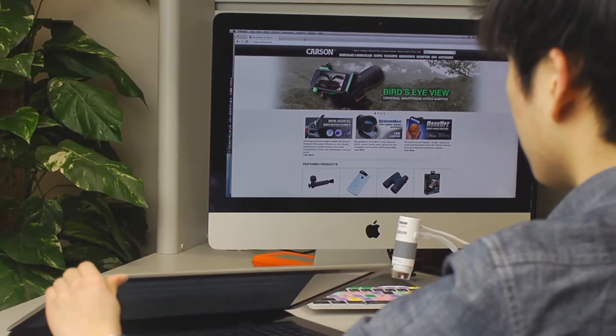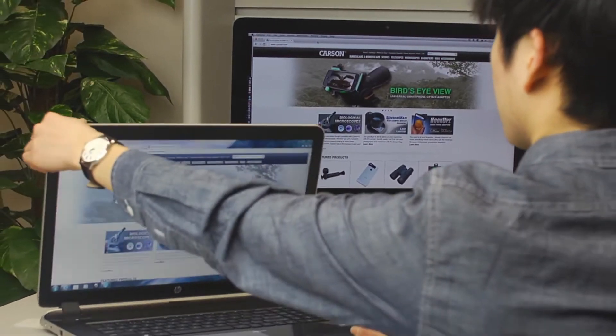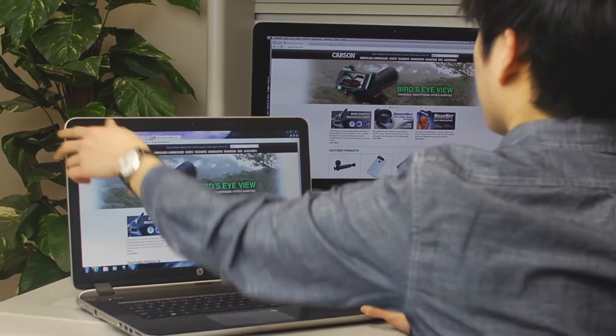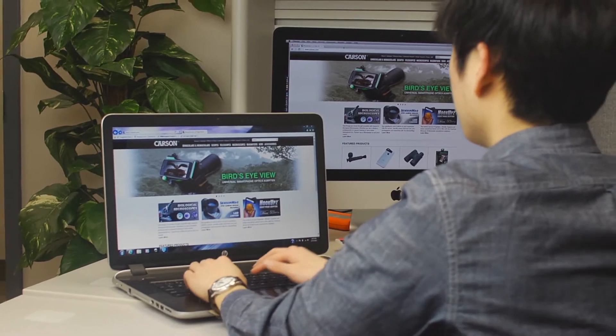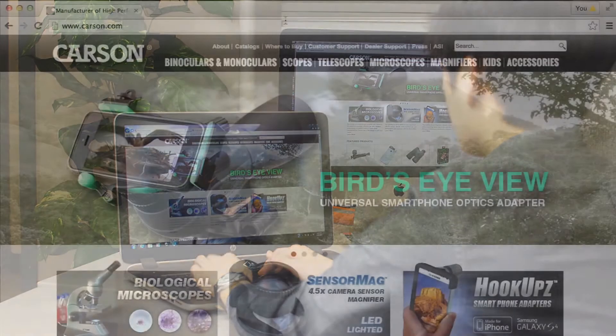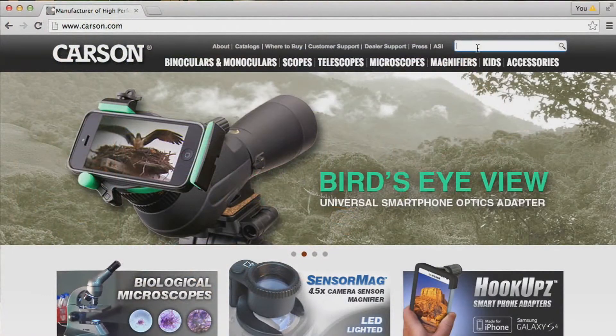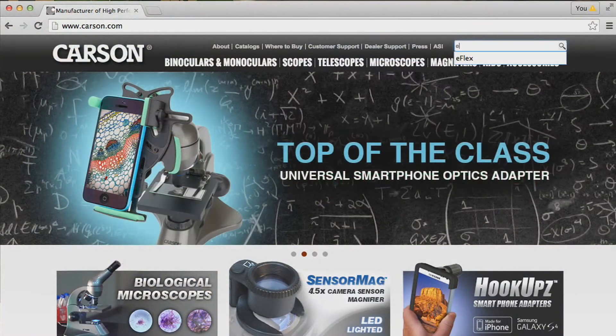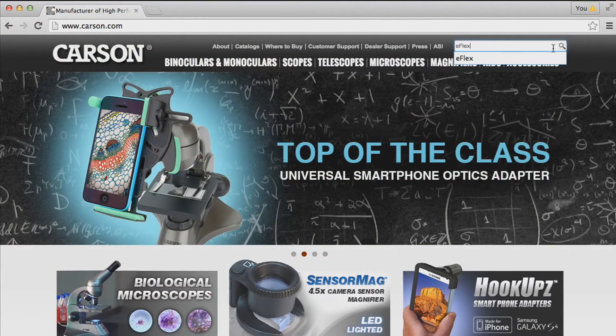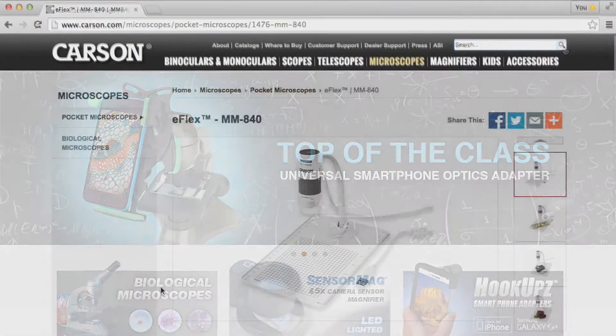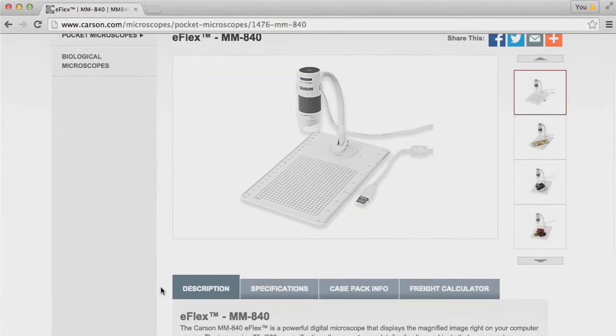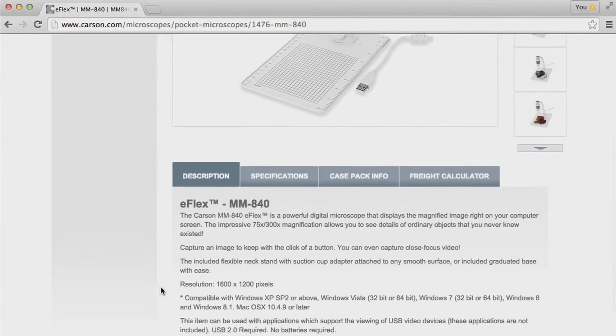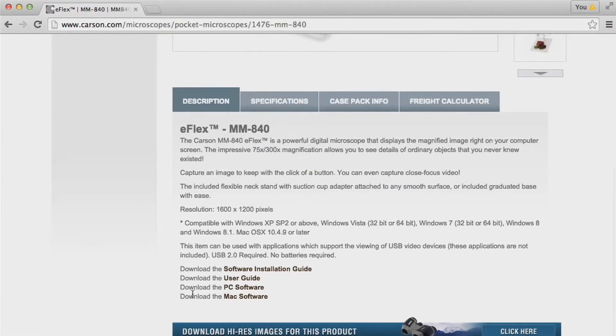The eFlex works on your desktop computer or laptop. The setup is simple and you only have to do it once. Just head to Carson.com, pull up the eFlex page and at the bottom you'll see downloadable software for both Mac and PC operating systems.